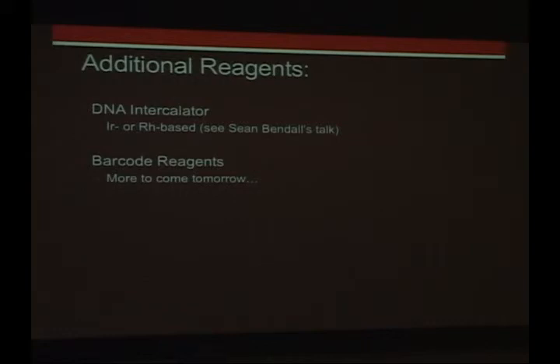And you probably know that on fluorescence, you have to use an antibody against BrdU. Well, IdU has very similar chemistry, iododeoxyuridine, and iodine has a molecular weight of 127, so we can actually measure IdU incorporation directly on the CyTOF. So that's a nice workaround to do proliferation type assays by CyTOF, very comparably to how you would do it by fluorescence, actually a bit easier.